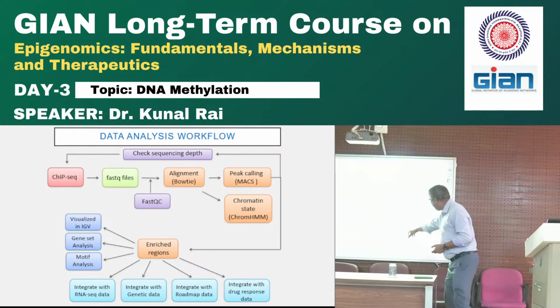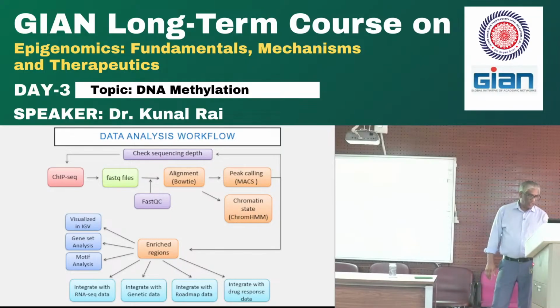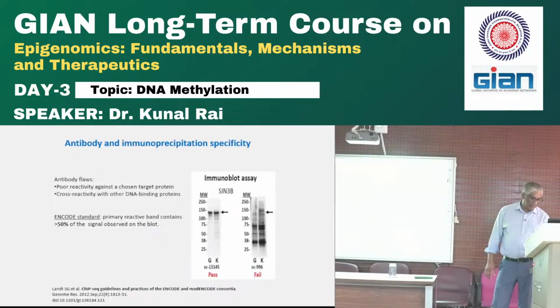So this peak here on the bottom, which is not a peak actually, but looks like a peak, some pile up, that's maybe 50 reads. Maybe this is 500 reads, okay? That's how it makes it. Cool? Okay, let's go back. I'm sorry, let's try to finish up in 4.